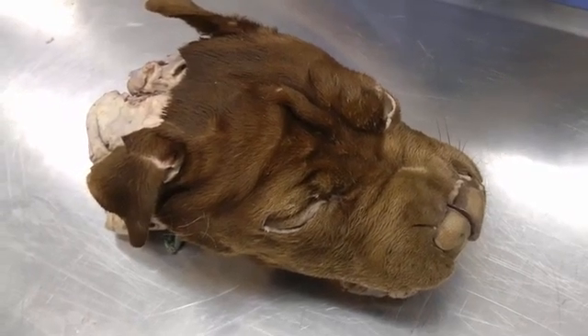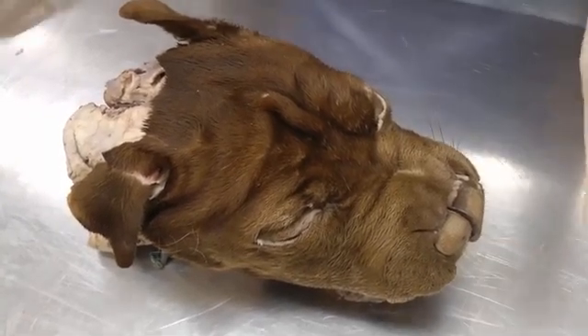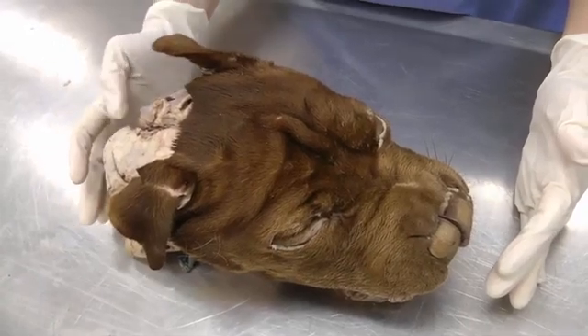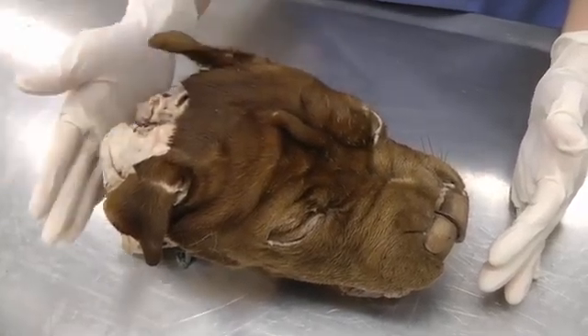This is lab 22 on the dog specimen. Today we're moving on to the head. You will remove your head from your cadaver by cutting it off around the fourth cervical vertebrae. You want to keep the larynx and the thyroid glands with the head.